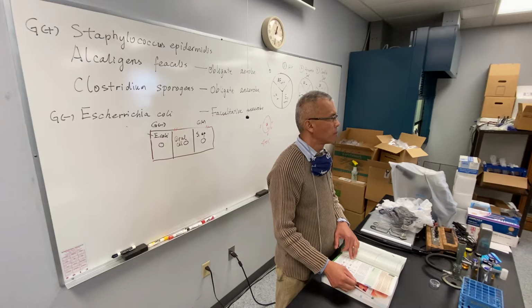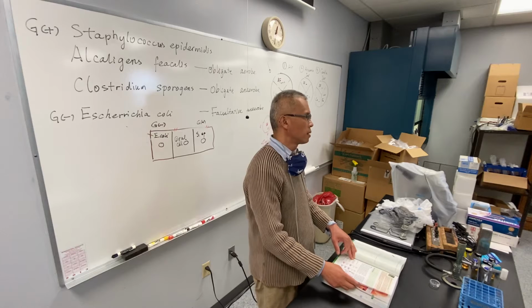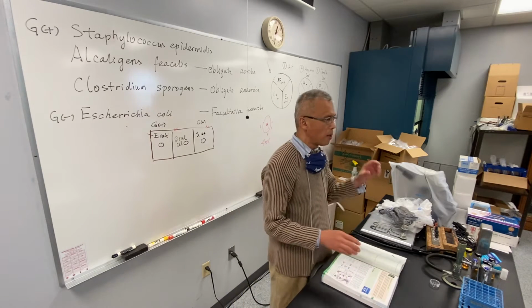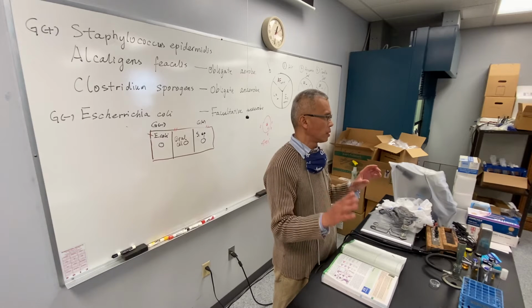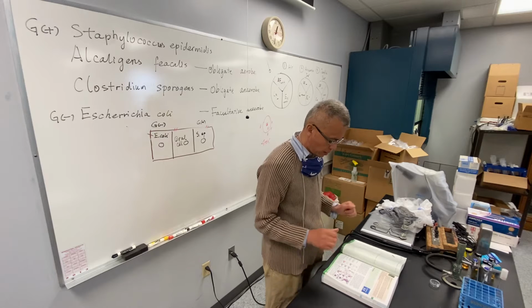Doesn't it help tell the difference between different organisms? Yeah. The Gram stain can tell Gram-negative versus Gram-positive, the two big families of bacteria, very different, right?